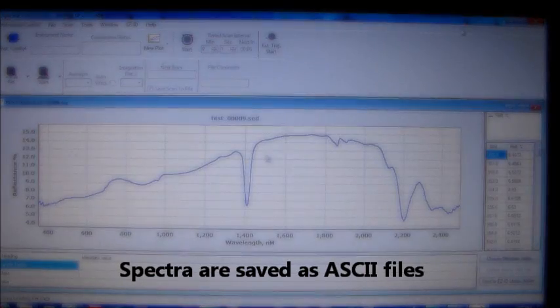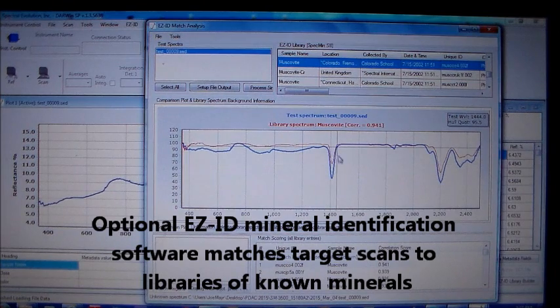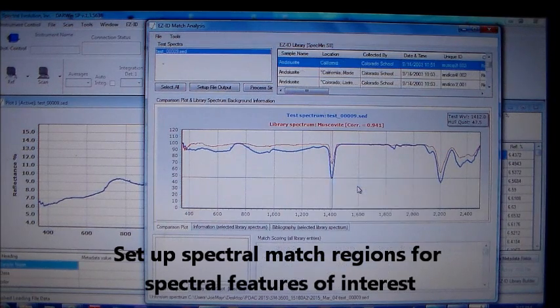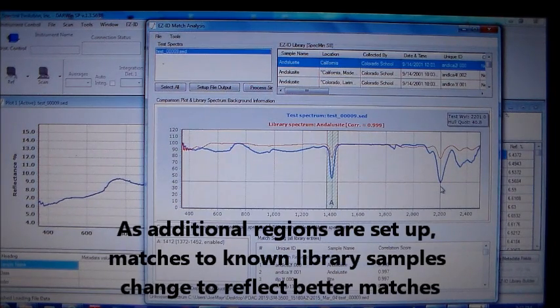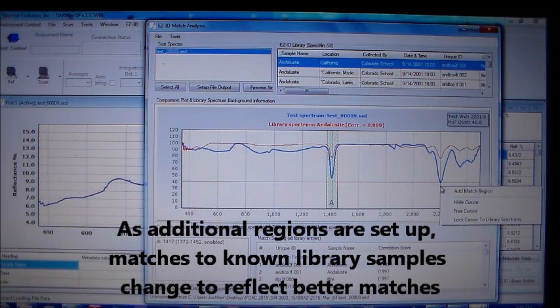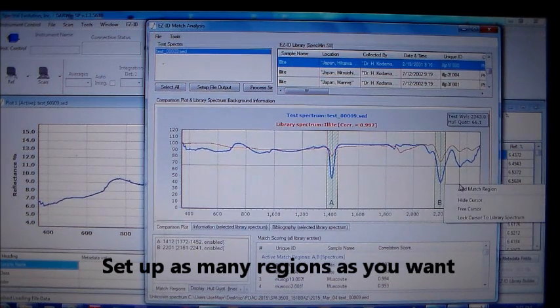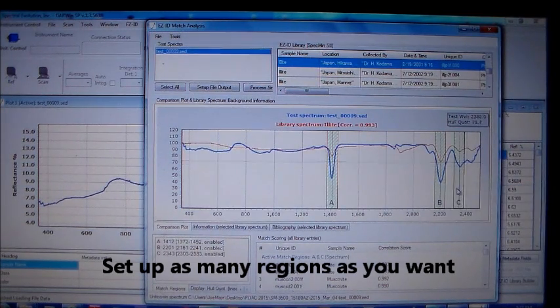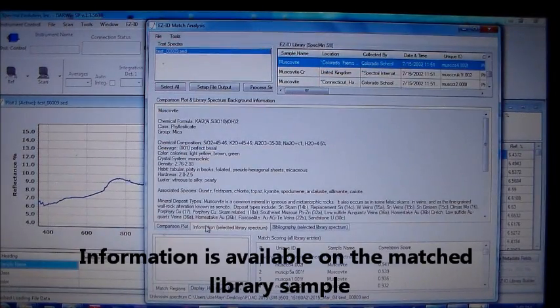The spectra and metadata are saved as an ASCII file. EasyID is an optional mineral identification program. It matches your target scans to known samples in the USGS and Specmin libraries that are included with it. EasyID allows the user to focus on different features by setting spectral match regions. As you focus on different features, the matching algorithm may change the known sample that it believes most closely matches. Add as many match regions as desired. For samples in the library, there is additional information as well as a list of bibliographic references available with a click.